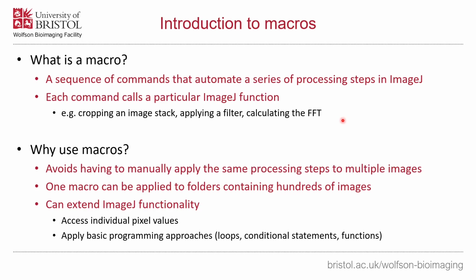Indeed, what you would do is use a sequence of commands and the basics of programming that we're going to go through to automate this, so that in addition to your macro where it's loading and filtering and identifying objects, it then automatically goes through and does that analysis for you.